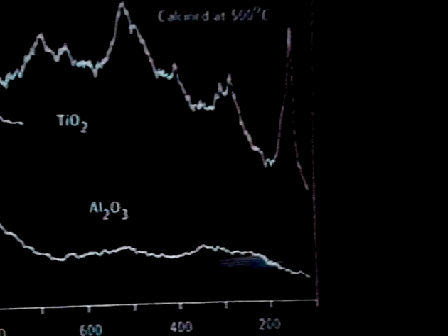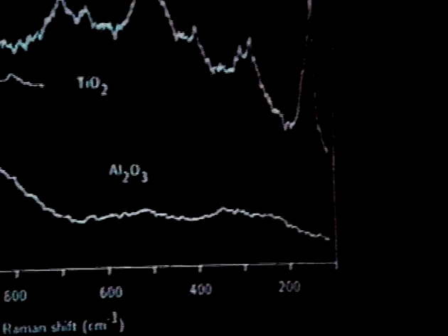These are associated with the bridging. This is the bending mode of the bridge. This is the linear stretch of the bridge.